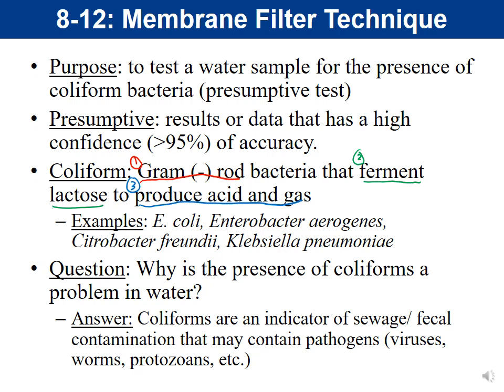So what that tells you is if you detect those coliforms in the water, it's likely that that water is fecally contaminated.